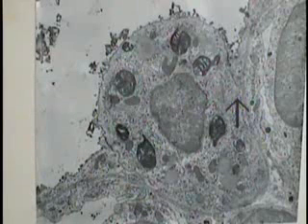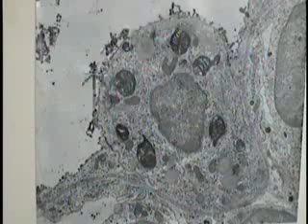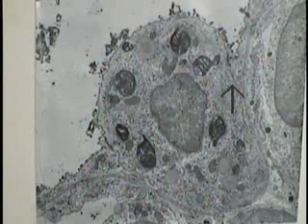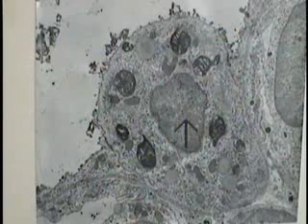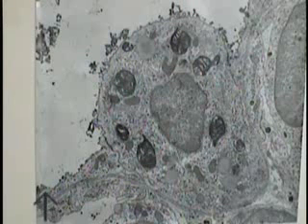This figure represents a transmission electron micrograph through a type 2 pneumocyte. This is the type 2 pneumocyte here, this cuboidal cell, and if you can envision what was observed earlier in a section of light microscopic material, this is that cube-like cell. It has a junction here with a type 1 cell, the cytoplasm of which is illustrated by the arrow going this way.